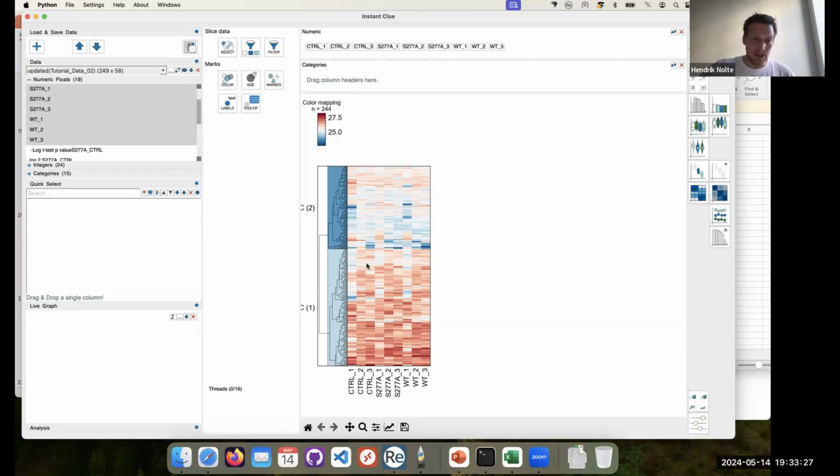On the other hand, you get these colorings here on the left side, which are labeled with C1 for cluster and C2. This is basically because the software tries to identify certain clusters. What we can do is click here and then move this line, and it refines the clustering or it doesn't.